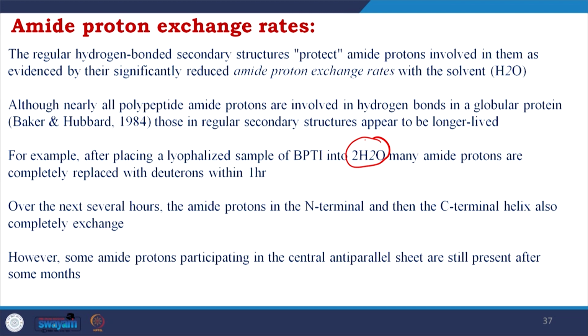So, this is very interesting and very useful additional experimental information, telling you which hydrogens are holding strongly. So, you keep making the experiments and you will see whether the replacement happened or not. If the replacement happened, they are relatively weaker. If they are still there, they are stronger.